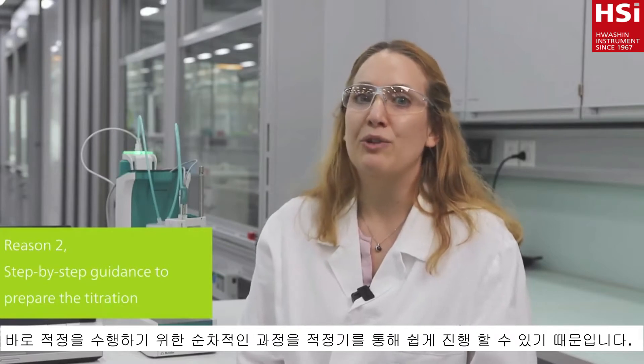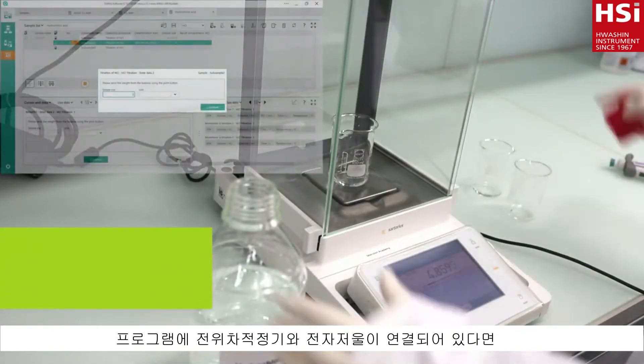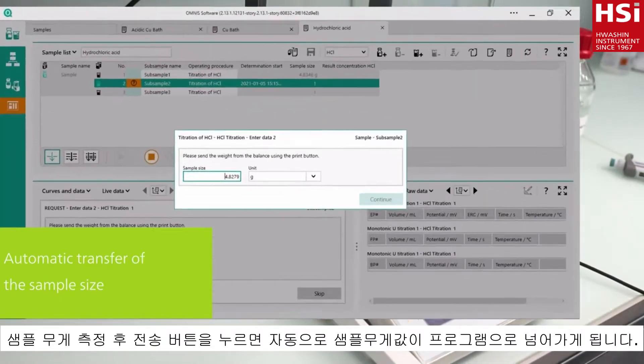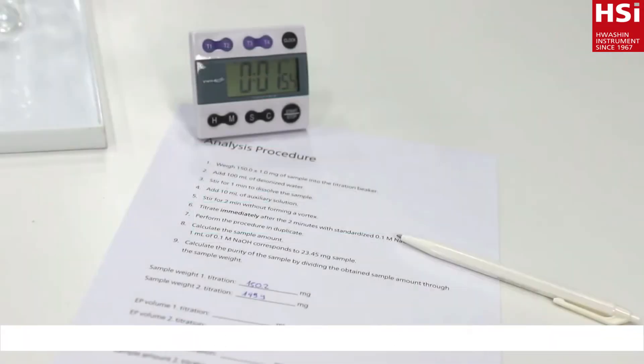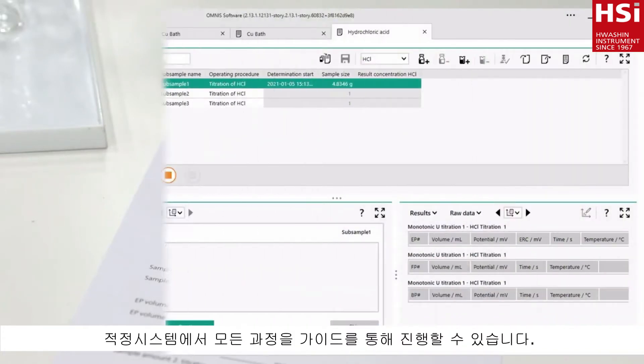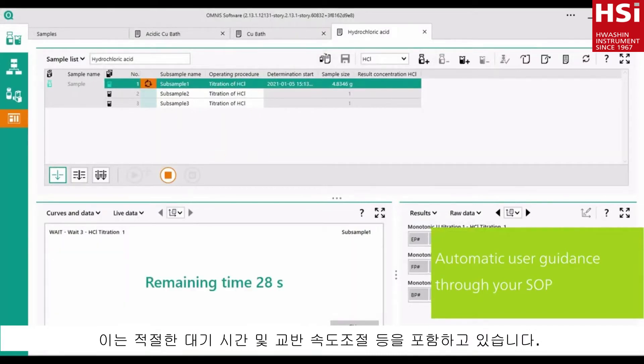My second reason to switch to automatic titration is the step-by-step guidance provided by my autotitrator. Forgetting to note down the sample size or adding an auxiliary solution are a thing of the past. With the balance connected to the titration system, I send the sample size with the push of a button to the titrator. Following an SOP on an automatic titrator is very easy. The system guides you step-by-step including waiting times, adjustment of stirring speed and more.